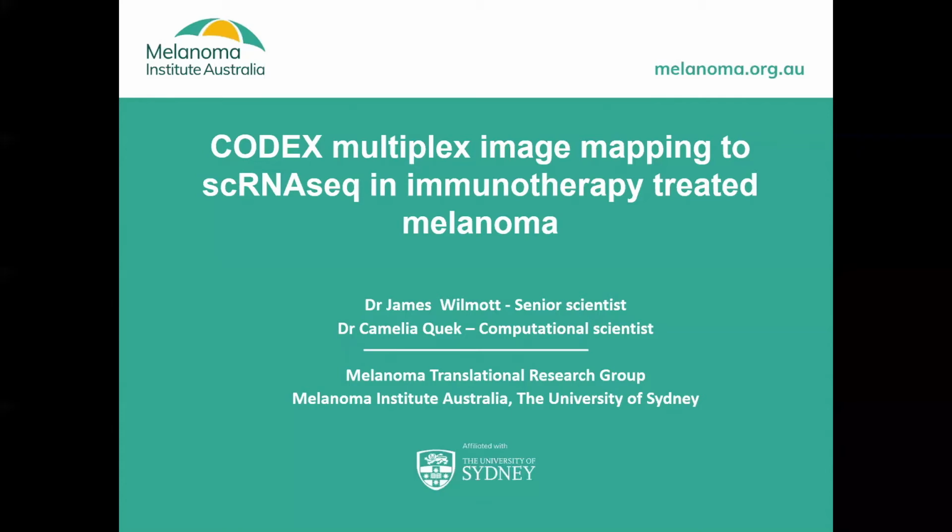Right, today I'll be talking to you about how we've been using the CODEX multiplex imaging system and how we've been trying to combine that with single-cell RNA-seq data to better understand the tumour microenvironment of patients treated with immunotherapies. It's a dual presentation, so I'm doing a lot of the image analysis and I love the pretty pictures, whereas Dr. Camelia Quek is a computational scientist in the group who takes the FCS files and the big data and makes the amazing plots with them. So it's a combined effort.